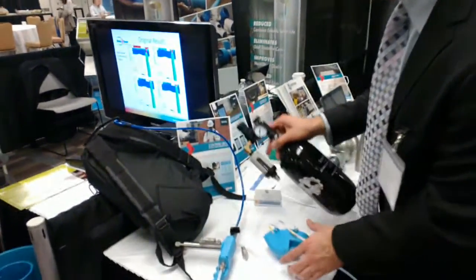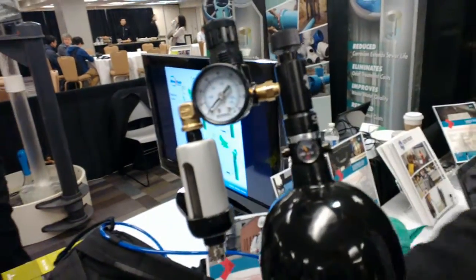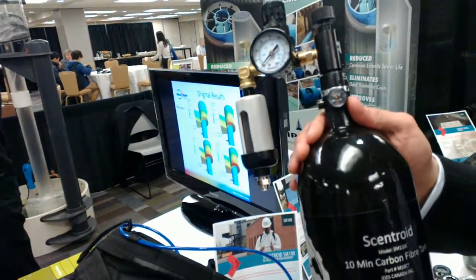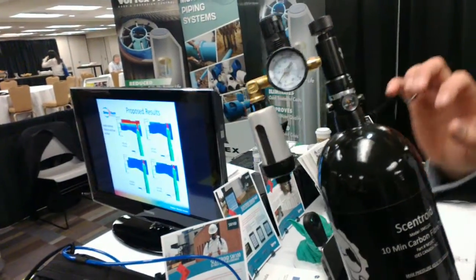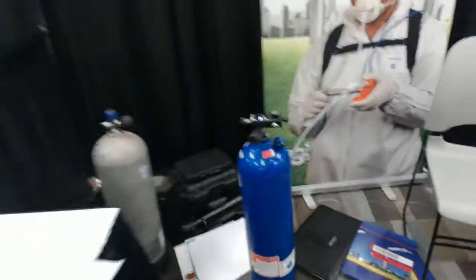Let me explain how it works. You have here a tank of compressed air. This tank holds about 20 samples worth of air for 15 minutes. The air inside is filled using scuba tanks, like that.